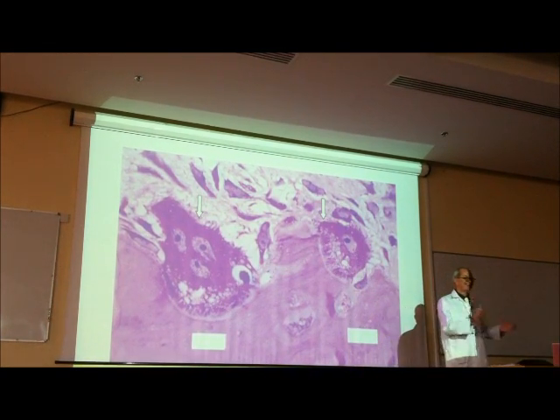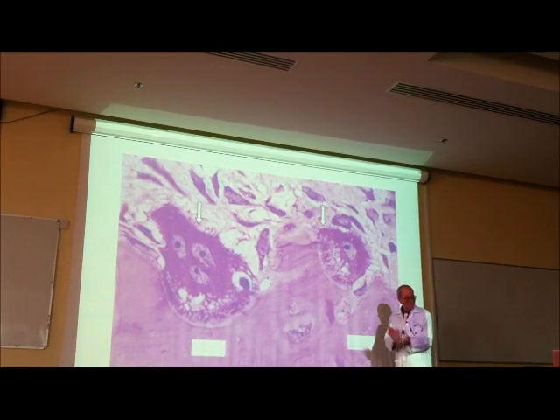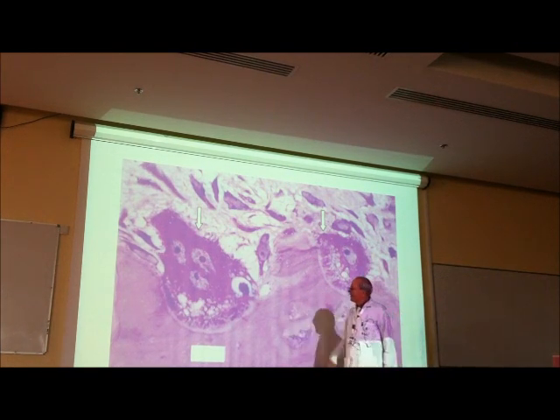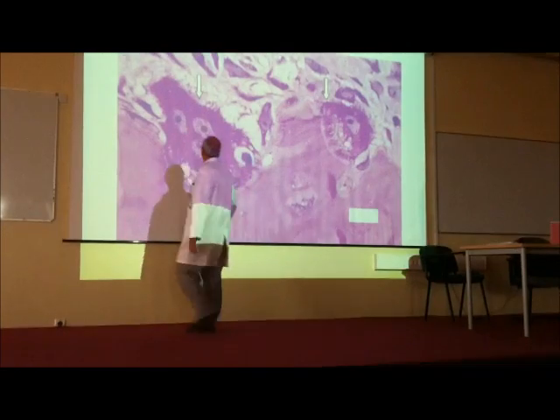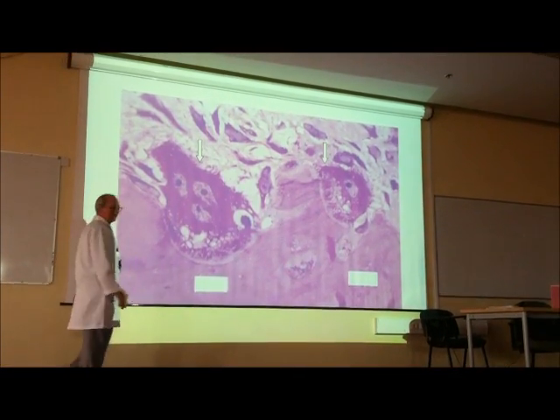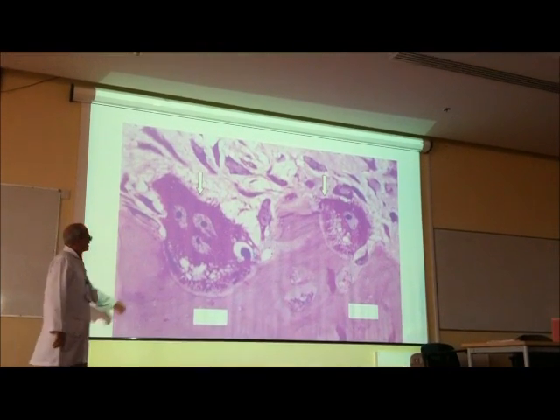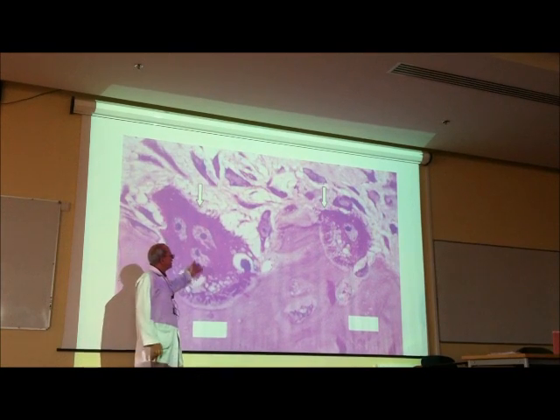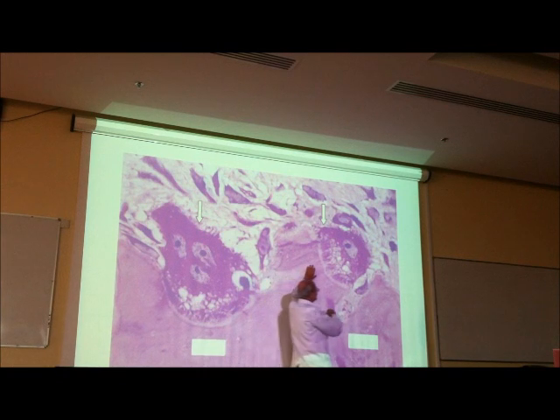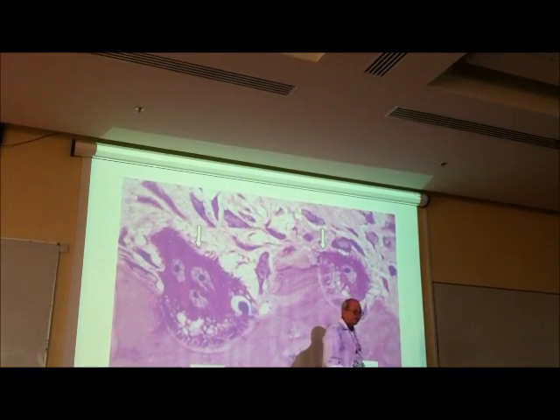Eat what? Macrophage. Bone. Eat bone. Osteoclast. How many? What is the character of that nuclei? One or multiple? Multiple nuclei. Is the cytoplasm acidophilic? Yes. They are present inside spaces or lacunae.